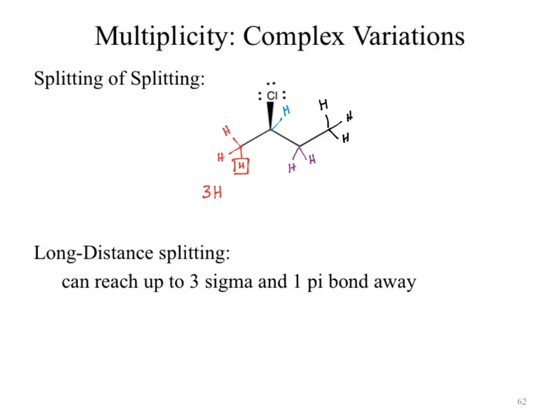How about the next one, the blue one? The 1H signal, the purple ones, black ones, 3H. Which of those 4 signals should have the highest chemical shift? The blue one should have the highest chemical shift because it's closest to the electronegative chlorine. Where would I expect the red and the purple to be?